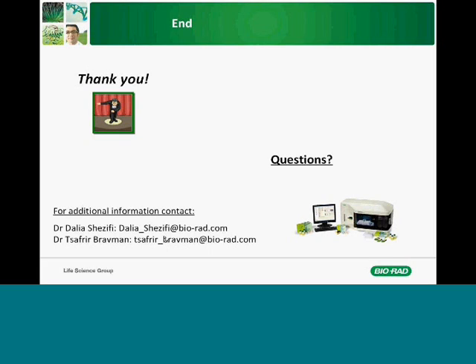So I would recommend 20 minutes or so, just to be on the safe side. You could do it for less time, but then you are at risk that some protein will be inactive. Maybe 20% of it will be inactive. I don't have a magic number.